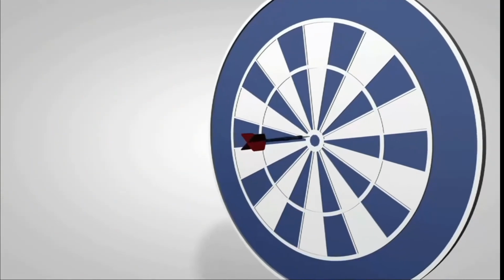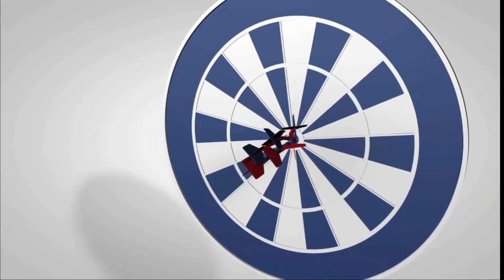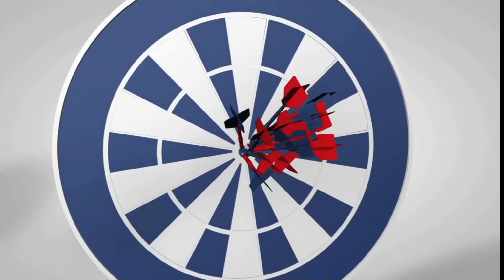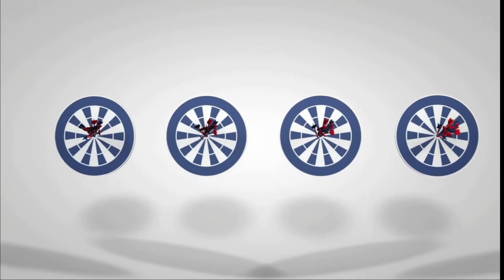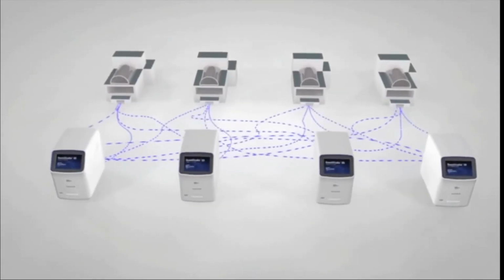Precision is another performance attribute of digital PCR. This is driven by the number of replicates or partitions that are run. Increasing replicates increases the statistical significance of your answer, thereby giving more confidence that the value determined represents the actual target quantity in the sample, and makes it possible to directly compare results across experiments and labs.